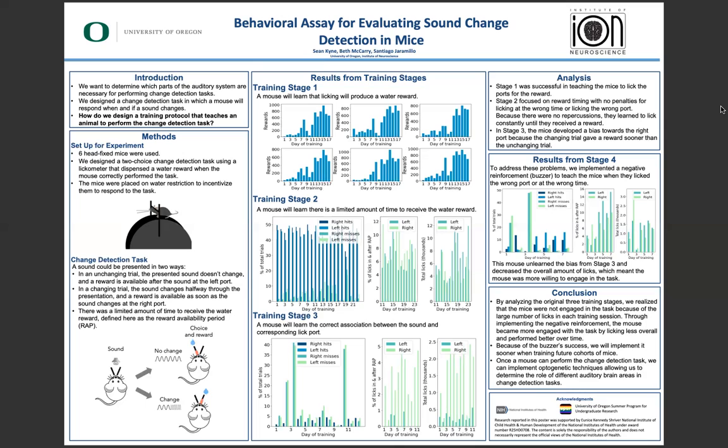In reviewing the training stages, I learned a few things. In stage two, I focused more on the timing of the reward without penalties, and due to the lack of repercussions, they learned to constantly lick until they had received a reward. In stage three, the mice developed a bias toward the right port since the changing trial gave the reward sooner than the unchanging trial. I concluded that the mice were disengaged with the task and licking excessively.